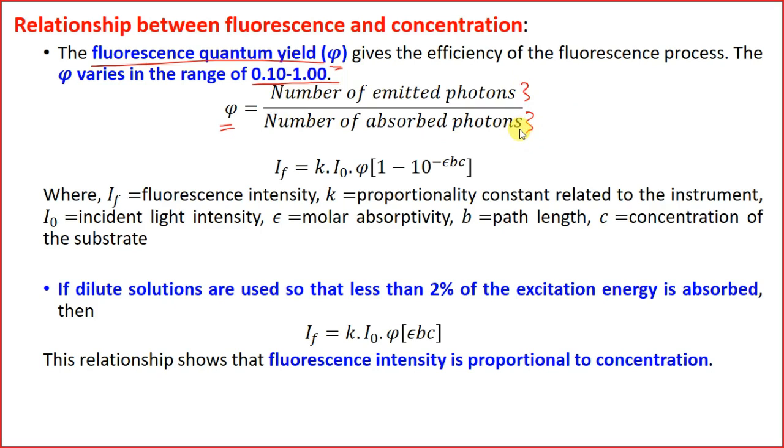That means the ratio of how many fluorescent photons have been emitted to how many photons have been absorbed by the solution.